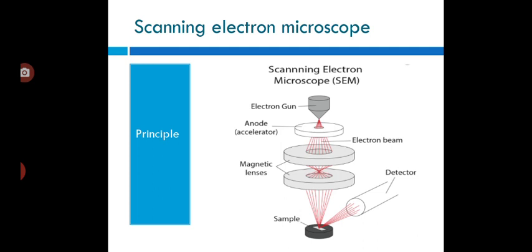the electrons. Specimens are observed in high vacuum in conventional scanning electron microscope, or in low vacuum or wet conditions in variable pressure or environmental scanning electron microscope, and at a wide range of cryogenic or elevated temperatures with specialized instruments. The beam of electrons, or the electron beam, is scanned in a scan pattern, and the position of the beam is combined with the intensity of the detected signal to produce an image.